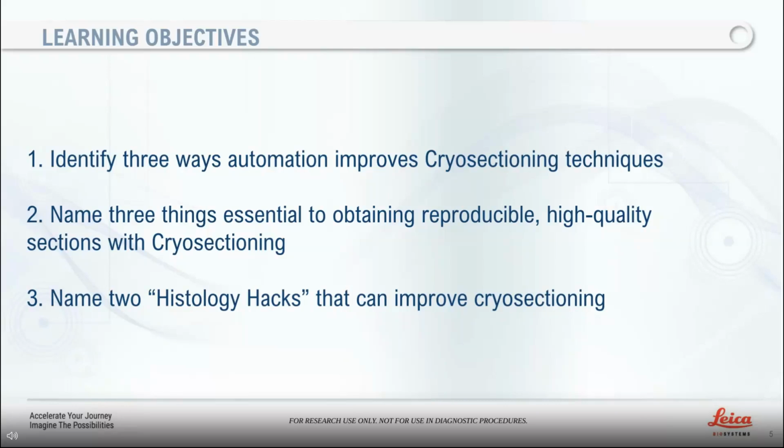So with that said, let's start with the main question. What is cryosectioning?